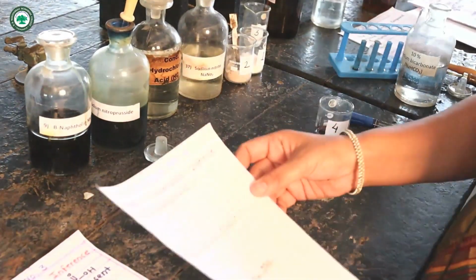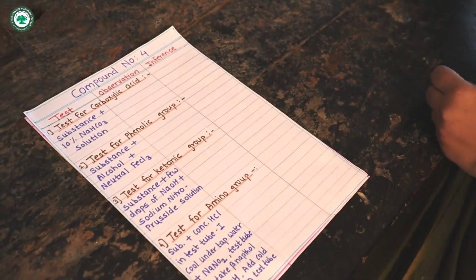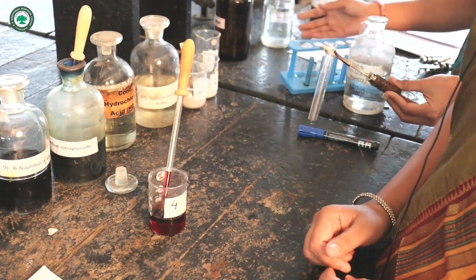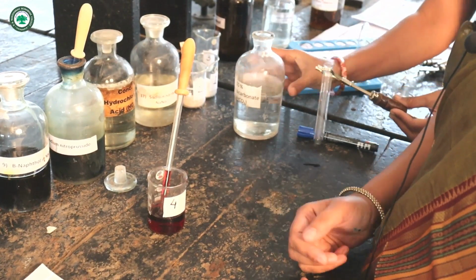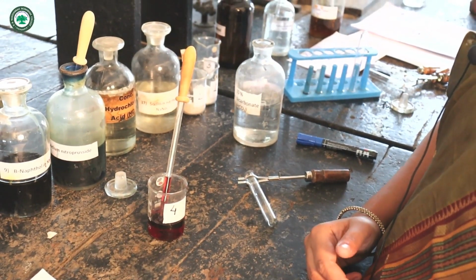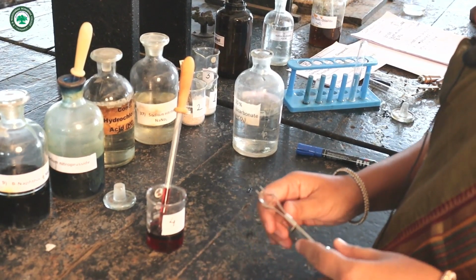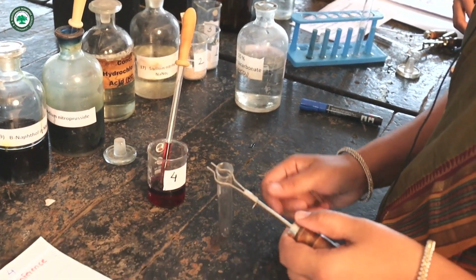Then fourth organic compound, it is also liquid. For this compound we have to take all tests. It may be carboxylic acid, it may be phenol, or it may be ketone, or it may be amino group. Therefore perform all the tests. First test is test for carboxylic acid. Then take a clean test tube with test tube holder.